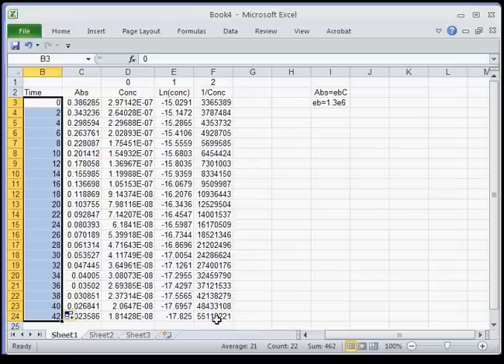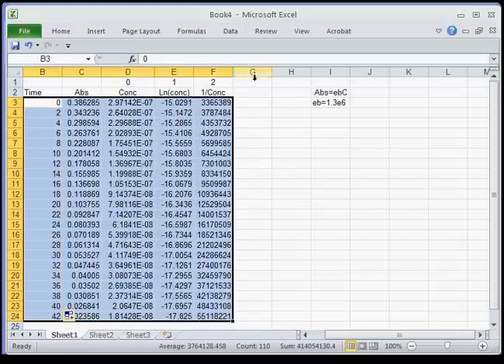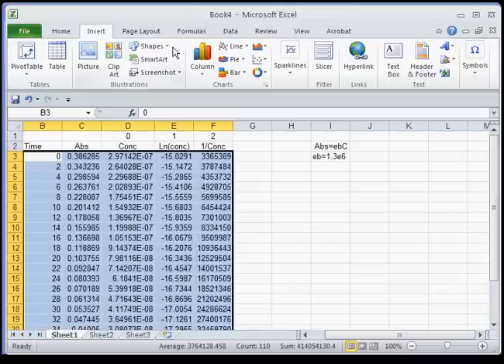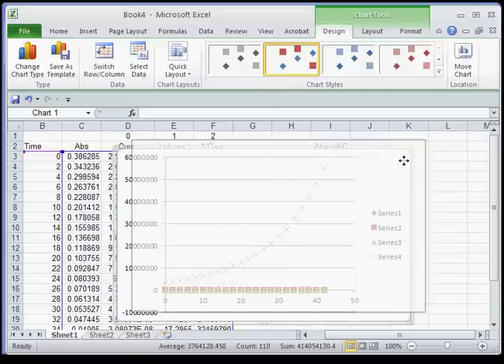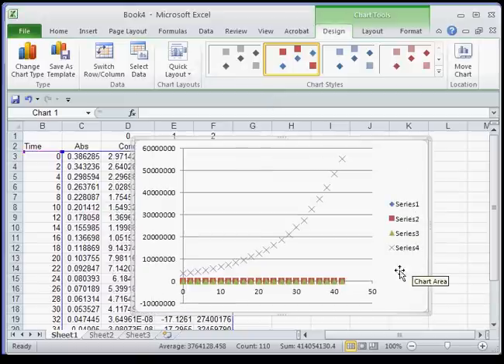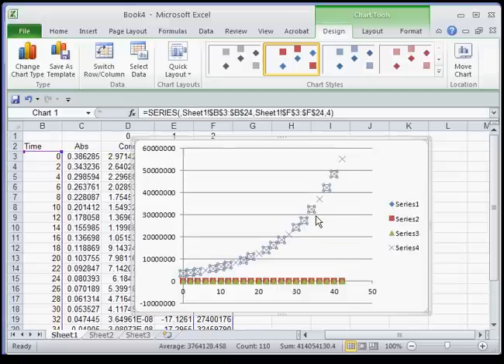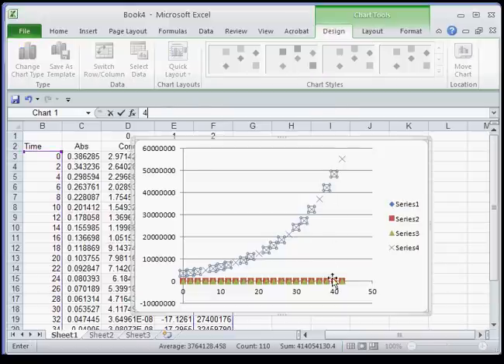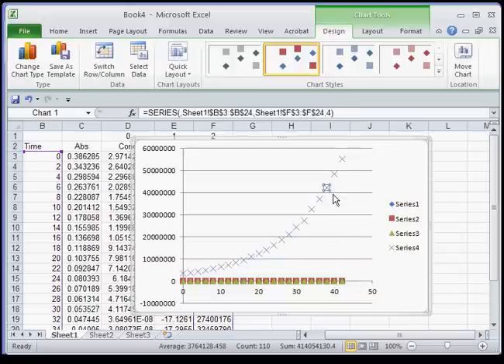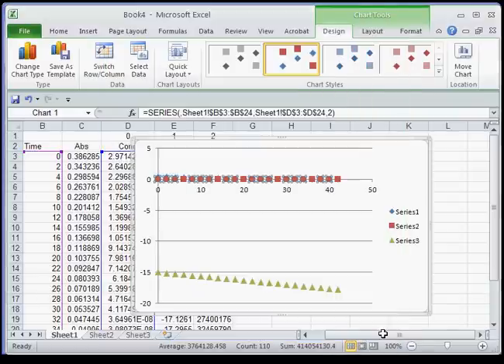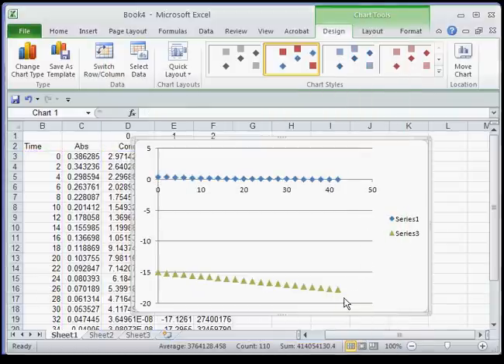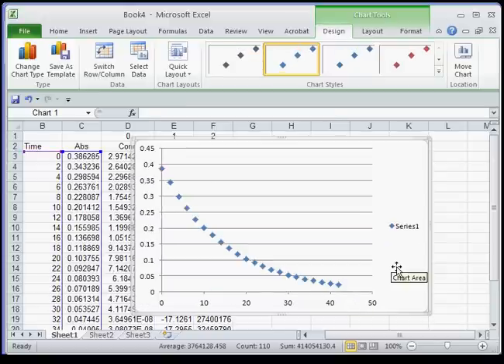Finally, I need to make a graph. The easiest way to do this — since you're going to make a number of graphs — is to highlight all the data, go to Insert, and do a scatter plot. You'll notice there's a bunch of data in there, and each one is series 1, 2, 3, and 4 — those are the four columns. I'm going to get rid of series 4, then series 2, then series 3. And there's your concentration versus time graph.